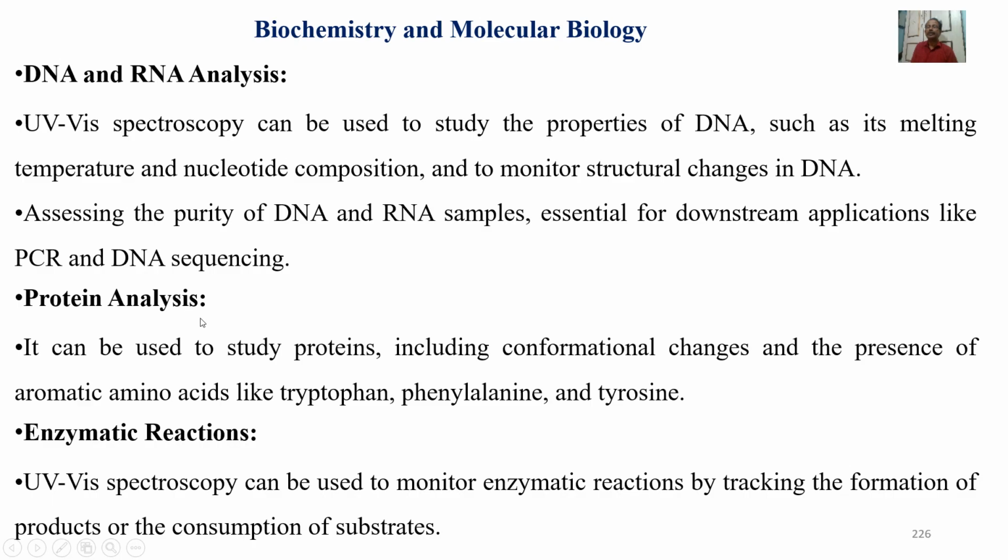Protein analysis. It can be used to study proteins, including conformational changes and the presence of aromatic amino acids like tryptophan, phenylalanine, and tyrosine. Enzymatic reactions. UV spectroscopy can be used to monitor enzymatic reactions by tracking the formation of products or the consumption of substrates.